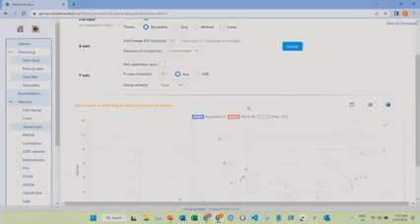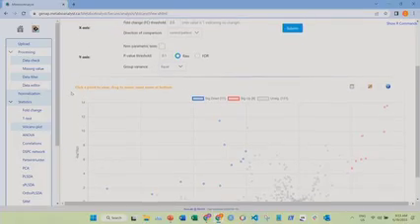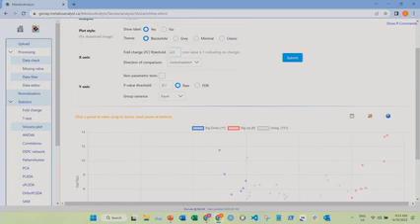So this is going to plot our data. Along the x-axis is the log2 fold change. And then on the y-axis is the negative log 10 of the p-value. So if those values are higher, that means that p-value is more significant. And then we've applied some thresholds. So we're looking at if the fold change is 2, we're saying it has to be greater than 2 for it to be significant. And we're looking at a raw p-value less than 0.1 here.